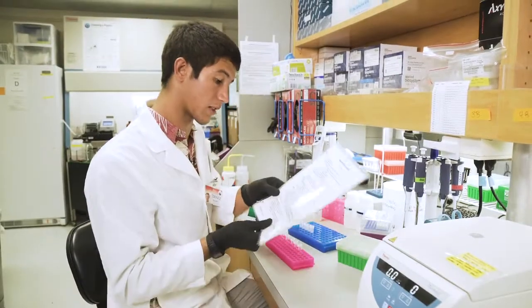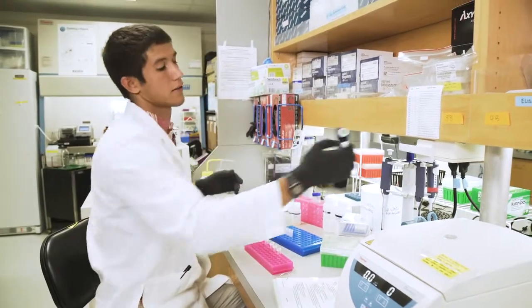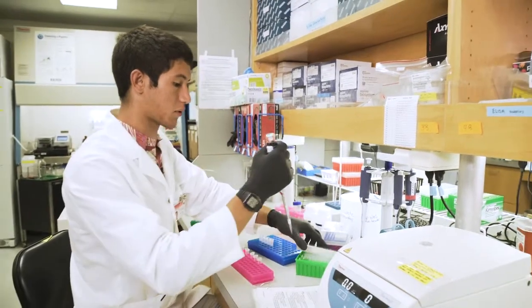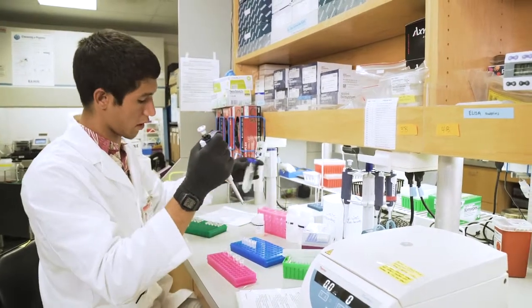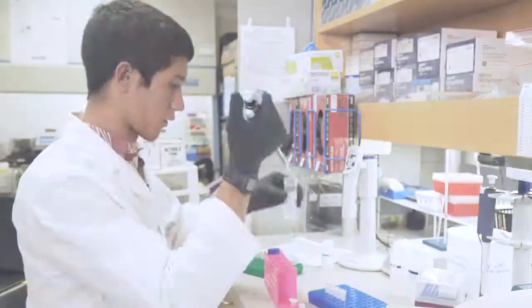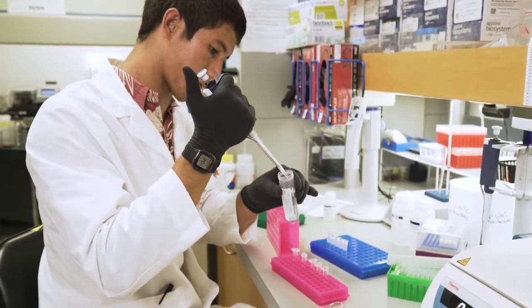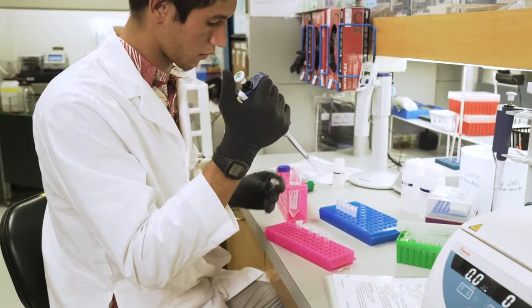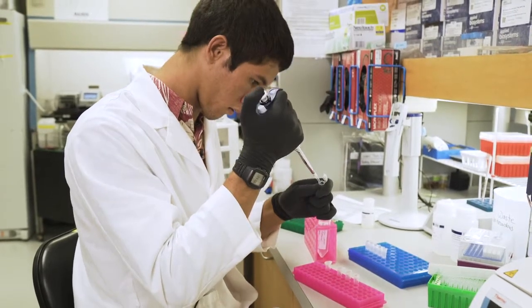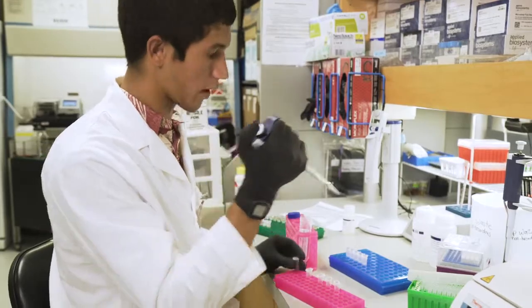We consult our protocol and it tells us to add 200 microliters, the same amount. So use the same pipette, use the same tips. And we take our ethanol, grab the whole rack, grab our 200 microliters of ethanol, and go ahead and add it to our sample. And there we go. Now we do that for the rest of them.